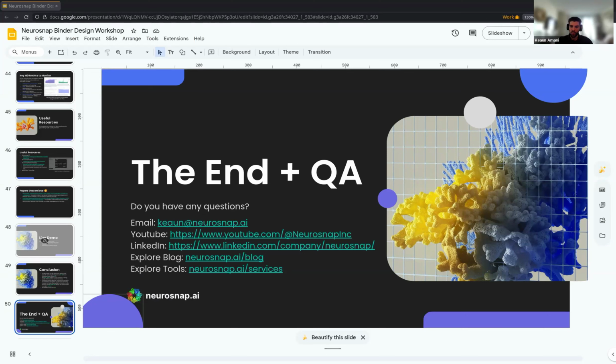Good presentation for PPI, especially for AGAB. Sometimes it would bind to the wrong interface. How to know that or correct it? Yeah, it's a good question. I think it would depend on the context. So if you'd like, you can send me an email later on, and I can take a look at it and give you my opinion. A lot of these you have to handle on a context-by-context basis and then just go from there.